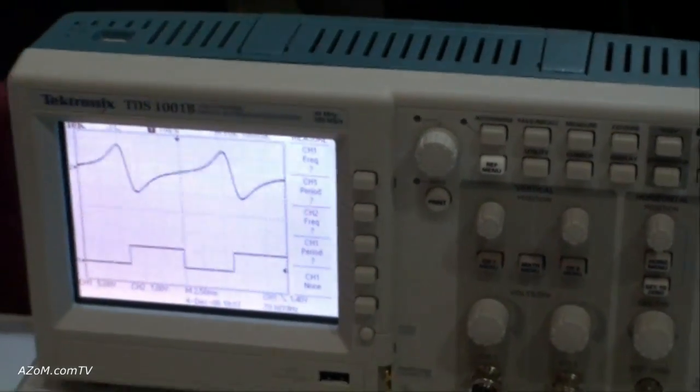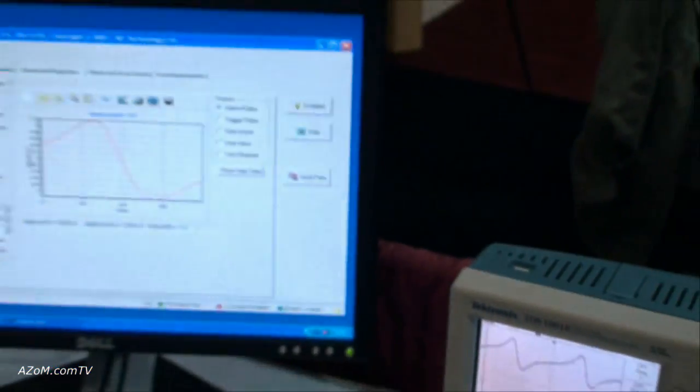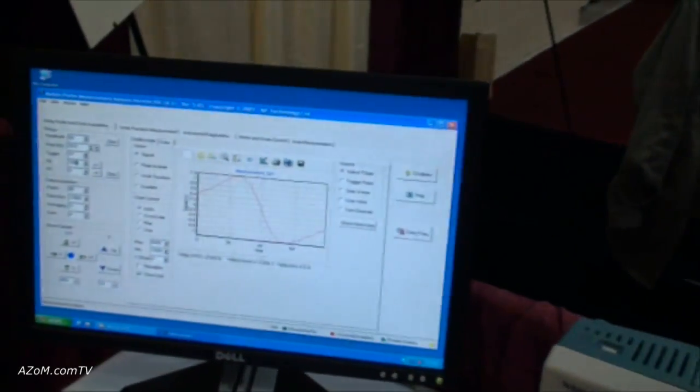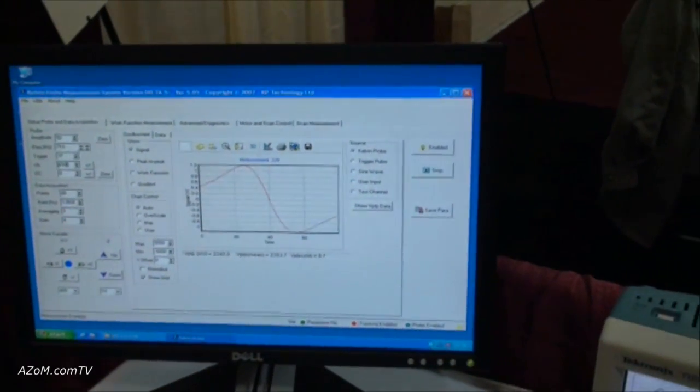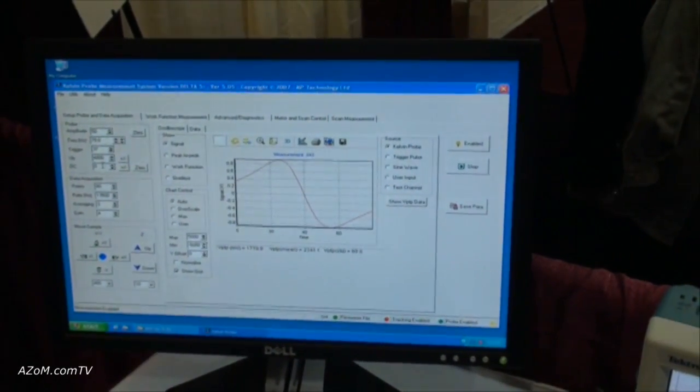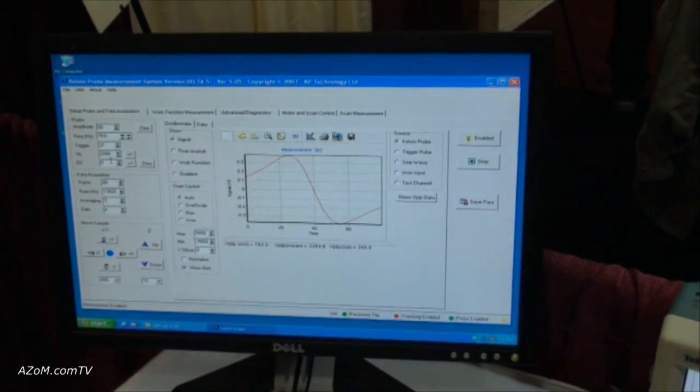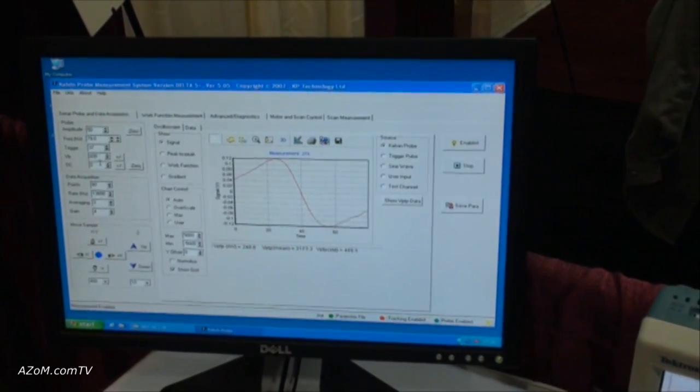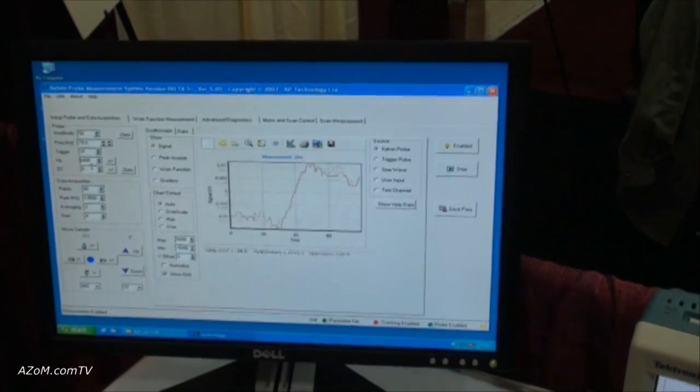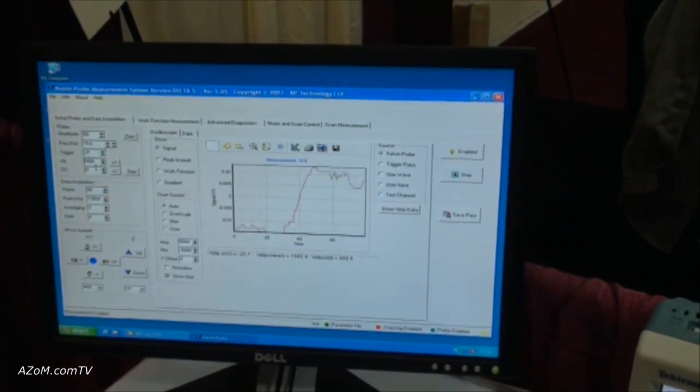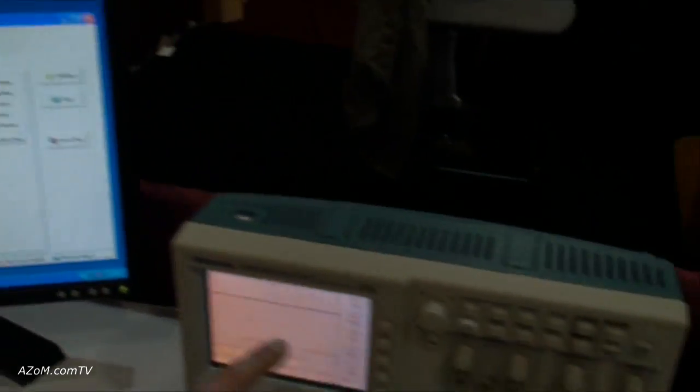We control the tip potential and the Kelvin probe measurement. If I control the tip potential, I can make the energy of the tip and the surface the same, and at that point I'll get zero signal. That's called the null field. As you can see, I've got a little bit of noise at null, but I've got a flat line on the oscilloscope.